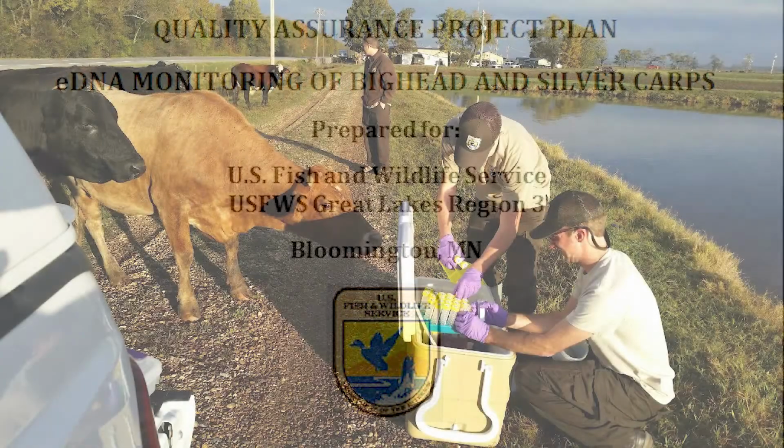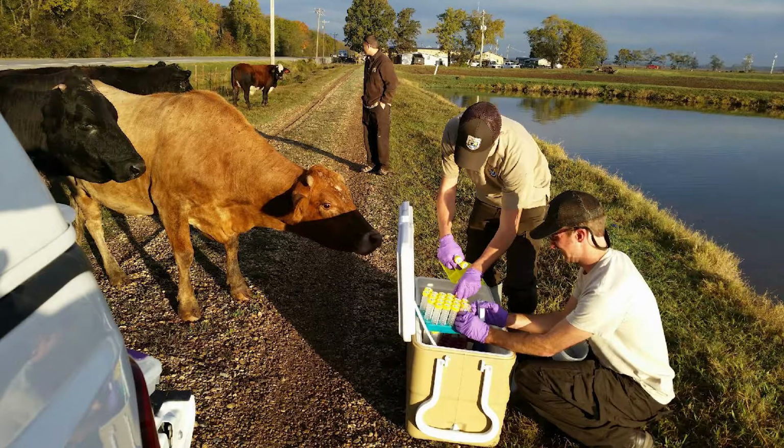Hi, I'm here to show you the process of preservative decanting and evaporation performed after receipt of field samples.